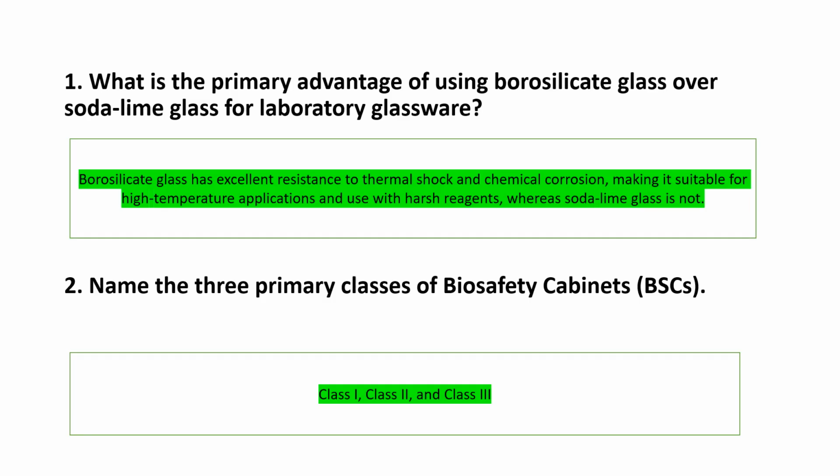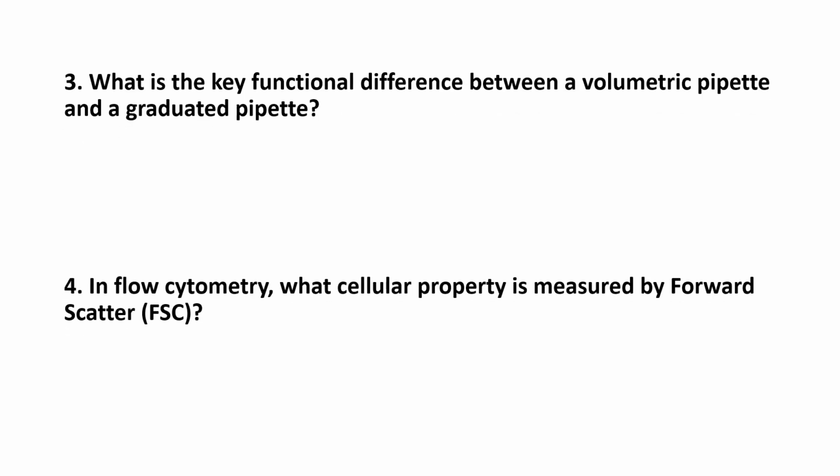Okay, we go to our third question. What is the key functional difference between a volumetric pipette and a graduated pipette? So make sure that you understand the question. That's one thing that I also wanted to comment. When you are answering questions, don't rush because you know the answer. Don't rush because you're just from revising your textbook or your notes about an hour ago. Ensure that you understand the question first before you proceed to answer.